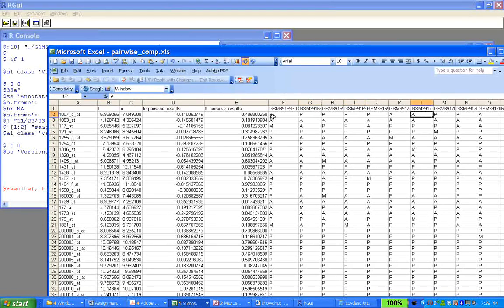So this condition will not be met because this particular probe set, first of all, doesn't have a test statistic of 0.01 or less, doesn't have a fold change of 1.5, it's only 0.11, and it's also not present in all 10 arrays because it's absent here and absent there.